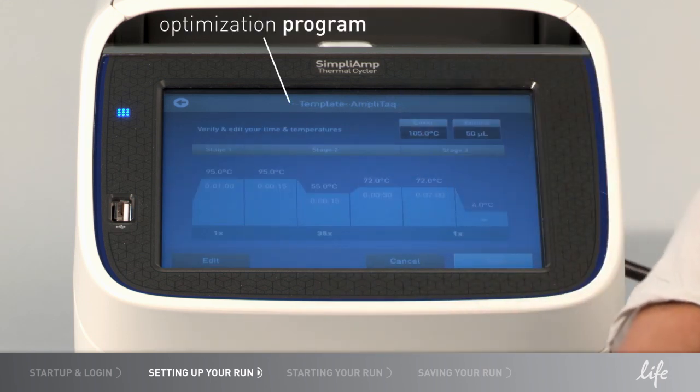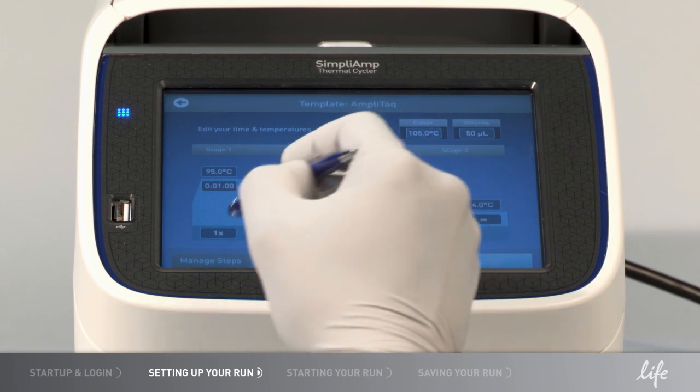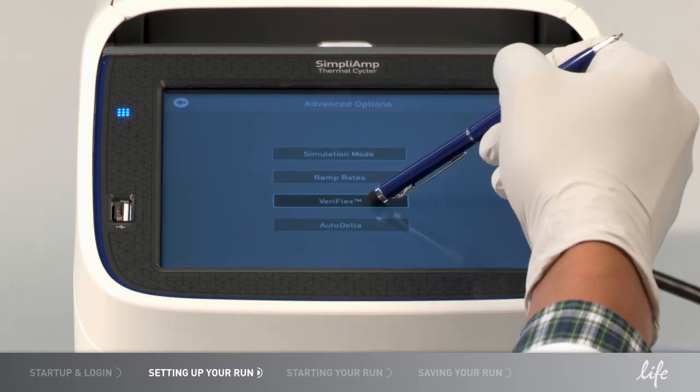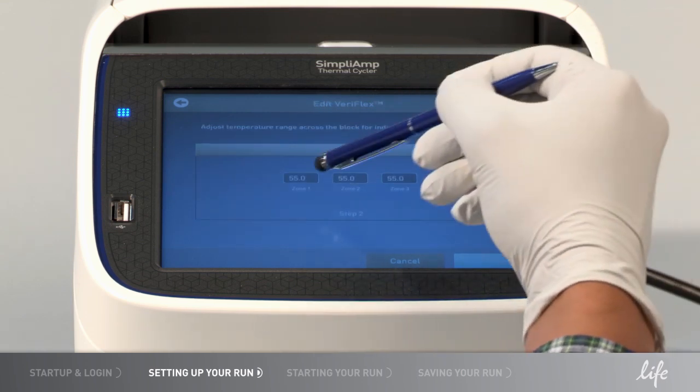If you would like to run an optimization protocol using the Veriflex zones, select Edit, then Manage Steps, then Advanced Options. With Veriflex blocks, you can program up to three independent temperature zones with a 96-well block.